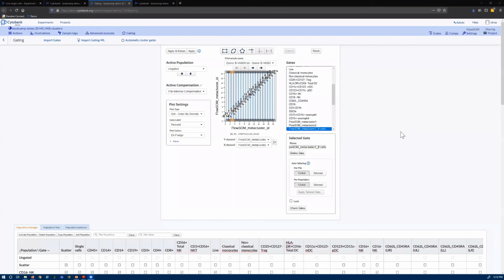that's why people will run clustering algorithms such as FlowSOM to reduce the dimension of your data, and project all your events to a 2D plot, so that you can easily identify the cell type for those cell clusters.